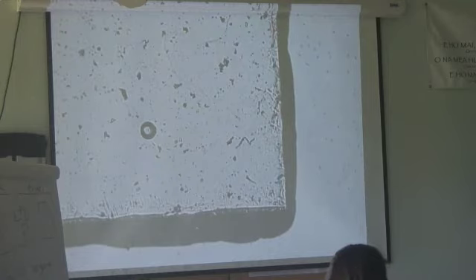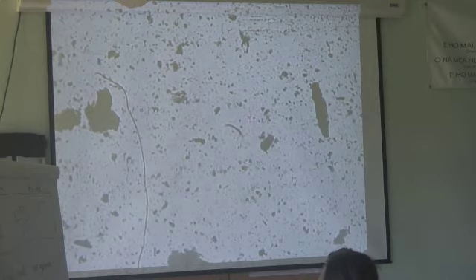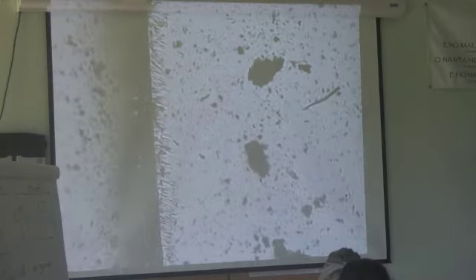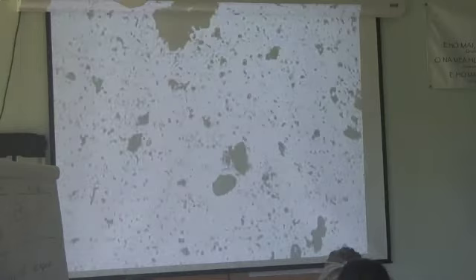Could be good fungi, could be actinos. My nematodes, where are you? It's almost nematode shaped, but nematodes are going to be clear. Some parts of their body are typically clear. Anything real broad at this end and sharpens to a point has got to be something off of micro-arthropods. So it does say you probably have micro-arthropods in here as well, which is good. That's a good thing.